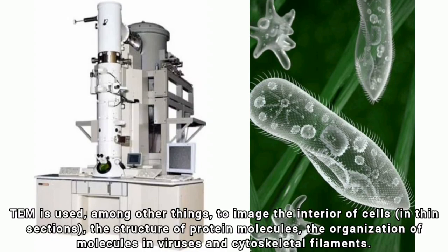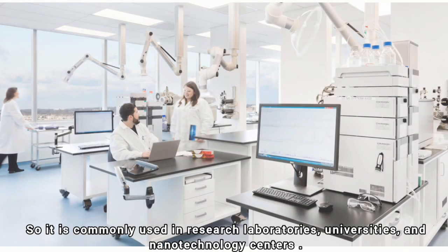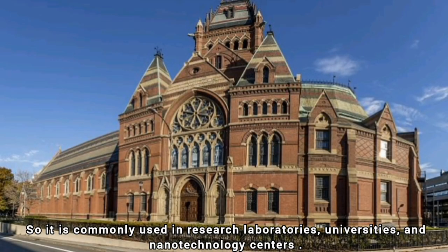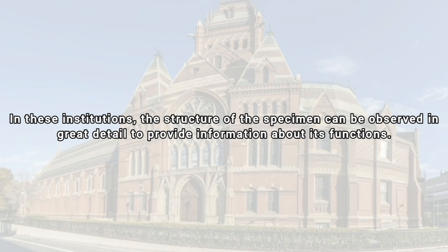Transmission electron microscope is used, among other things, to image the interior of cells in thin sections, the structure of protein molecules, the organization of molecules in viruses, and cytoskeletal filaments. Electron microscopes are very expensive, so they are commonly used in research laboratories, universities, and nanotechnology centers. In these institutions, the structure of the specimen can be observed in great detail to provide information about its functions.